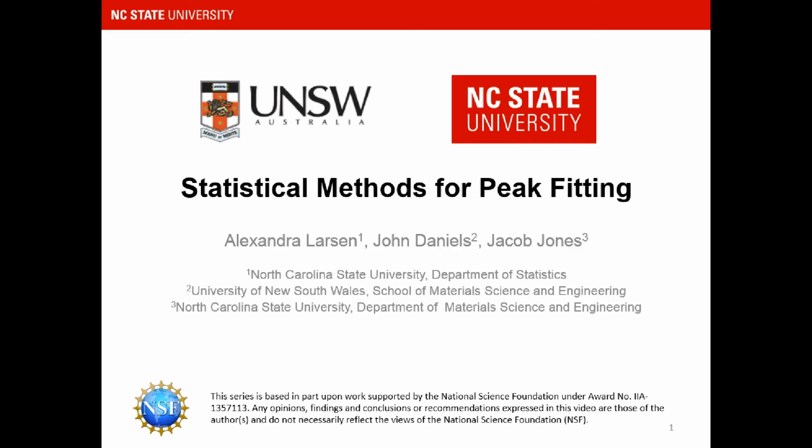This video will introduce you to peak fitting, a common analytical approach for analyzing spectroscopic and diffraction data for materials characterization. Specifically, I will compare the most common approach to peak fitting involving least squares minimization to a new method using Bayes' theorem combined with a sampling algorithm. These two methods are fundamentally different, and I'll walk you through their differences and similarities.